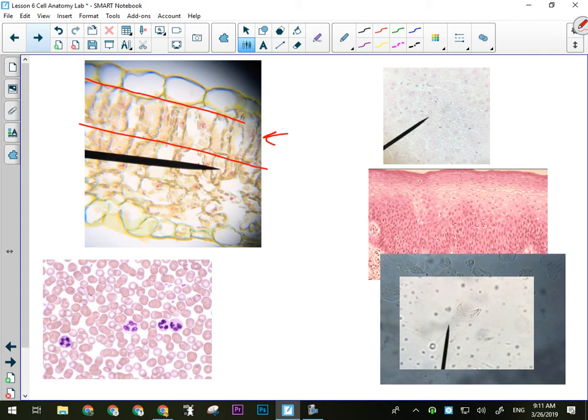The reason it carries out photosynthesis, what do you suppose these yellowish green things are? Those are chloroplasts. You'll see them that clearly. They're very evident, and quite large. The pink dots would probably be the nucleus, and the little pink dot inside is the nucleolus. You can see here on the edge, it looks like it has a beard. You're going to see all those things that I told you you would see.